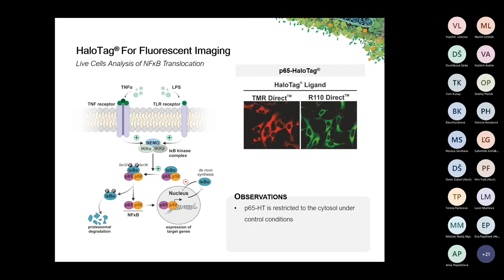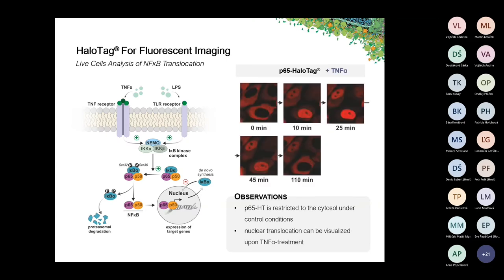Here you can see a staining performed with either the TMR direct HaloTag ligand or the R110 direct ligand on P65-HaloTag fusions. Under non-stimulated conditions this gives a nice staining of the cytosol with the nucleus completely excluded. When TNF-alpha is added and live cell imaging performed, we can see a time-dependent increase in nuclear staining starting at around 10 minutes, reaching a maximum at around 25 minutes, followed by a gradual decline due to relocalization of P65 back to the cytosol.